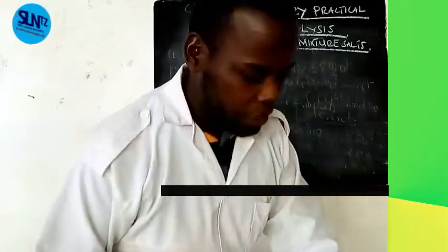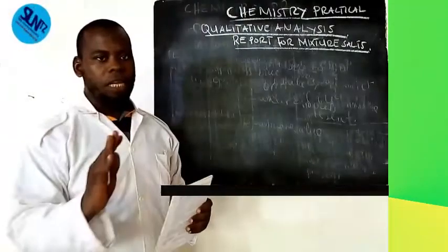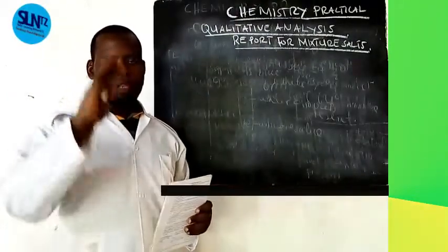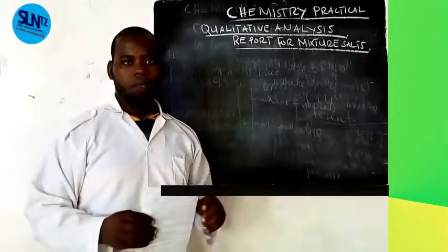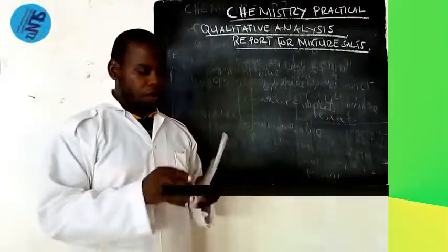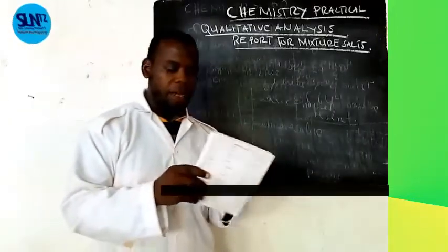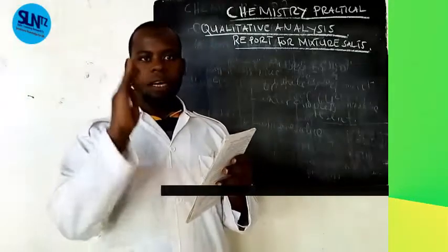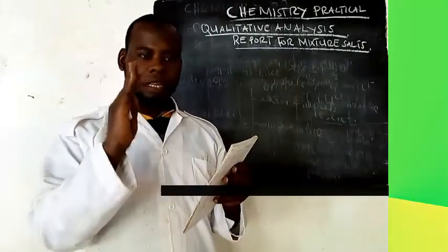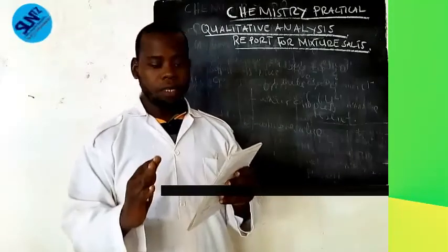Let's go directly to how to write a report. I will show you 3 examples, or if time is enough, we can see 4 examples. When you open your sheet, we have white color. We have samples which are blue, green, yellowish brown or brown.